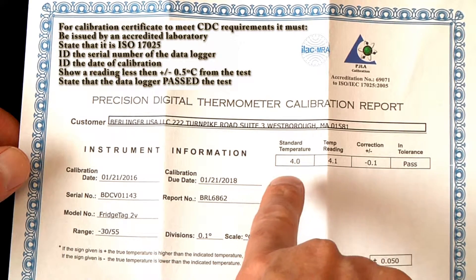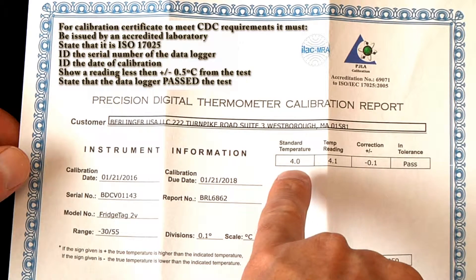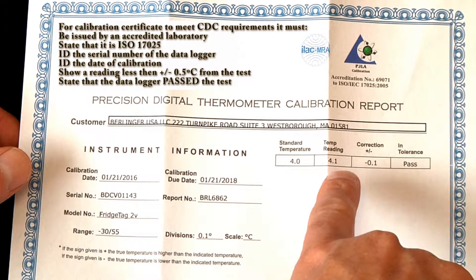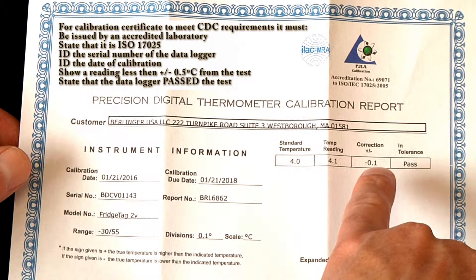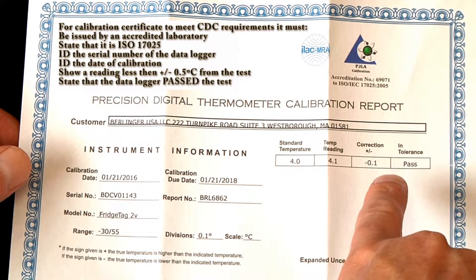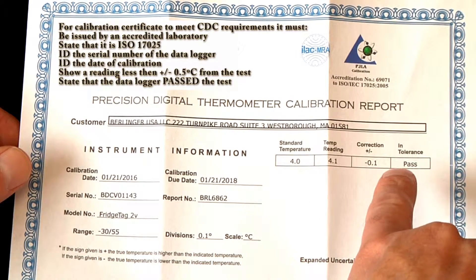It must show how the device was tested. In this case it was tested against a 4.0 degree temperature and it read 4.1 degrees C, which is a tolerance of 0.1 degree. The CDC acceptance range is 0.5 degrees, so this product passes the test.